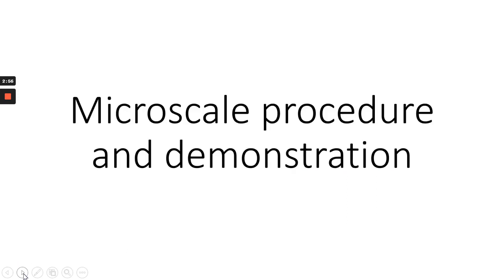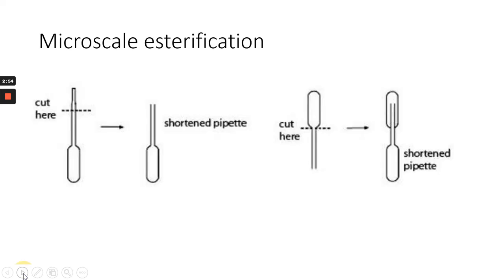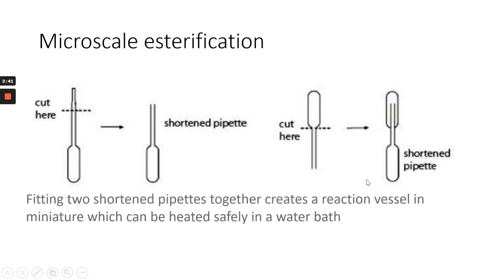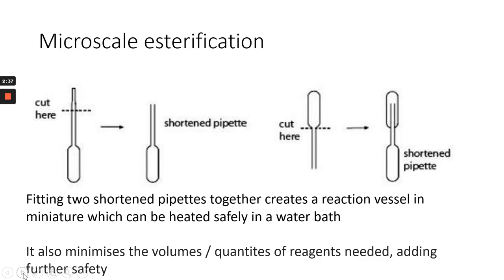We're going to have a quick look at the demonstration, so I'll put the equipment up. We cut two plastic pipettes — one near the tip and one near the bulb — and one can fit inside the other, as you can see. This forms our reaction vessel, and it can be heated quite safely in a water bath. It also helps minimise the volume and quantities of reagents needed, adding further safety.